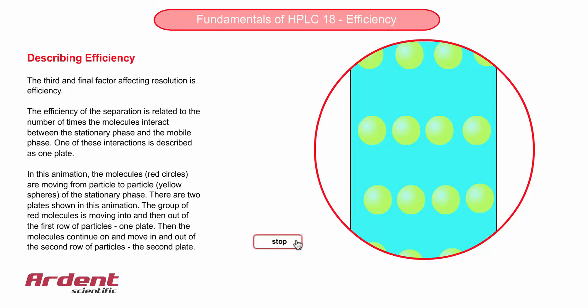In this animation, the molecules, which are the red circles, are moving from particle to particle, the yellow spheres, of the stationary phase. There are two plates shown in this animation.